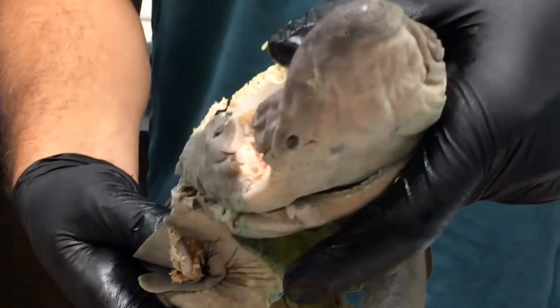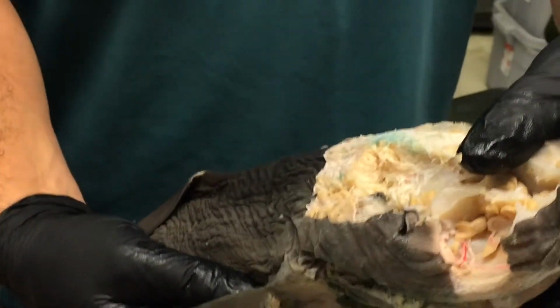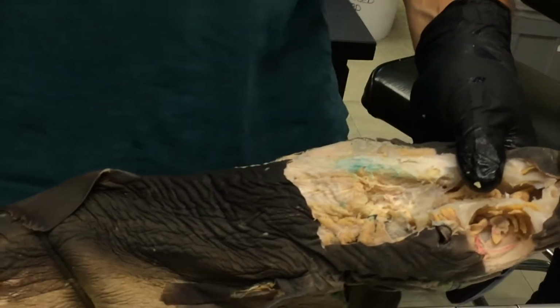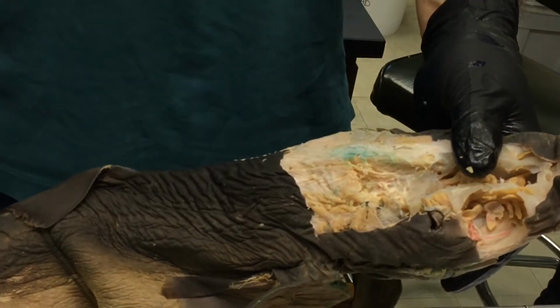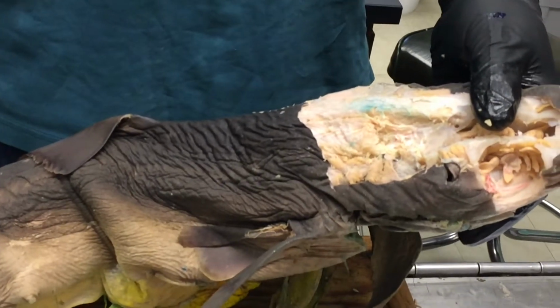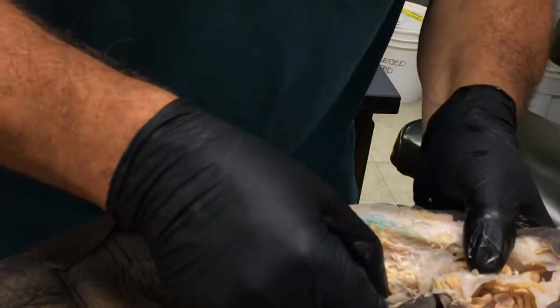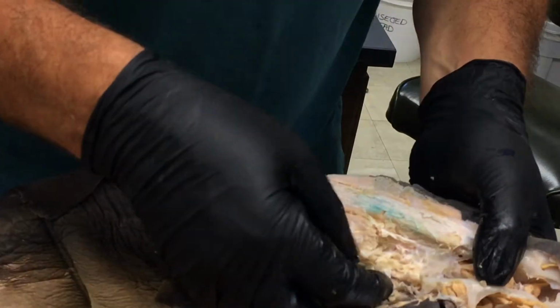Okay. That is where the vein goes through, though, right? Anterior. The posterior cardinal vein goes through the sinus. This is the anterior cardinal. Anterior, yeah. Sinus or vein. A sinus is just a big vein, so it's called a sinus in a shark. More generally, it's the anterior cardinal vein. Okay. So that's this big space here that we've opened up. Anterior cardinal. Get my probe back.